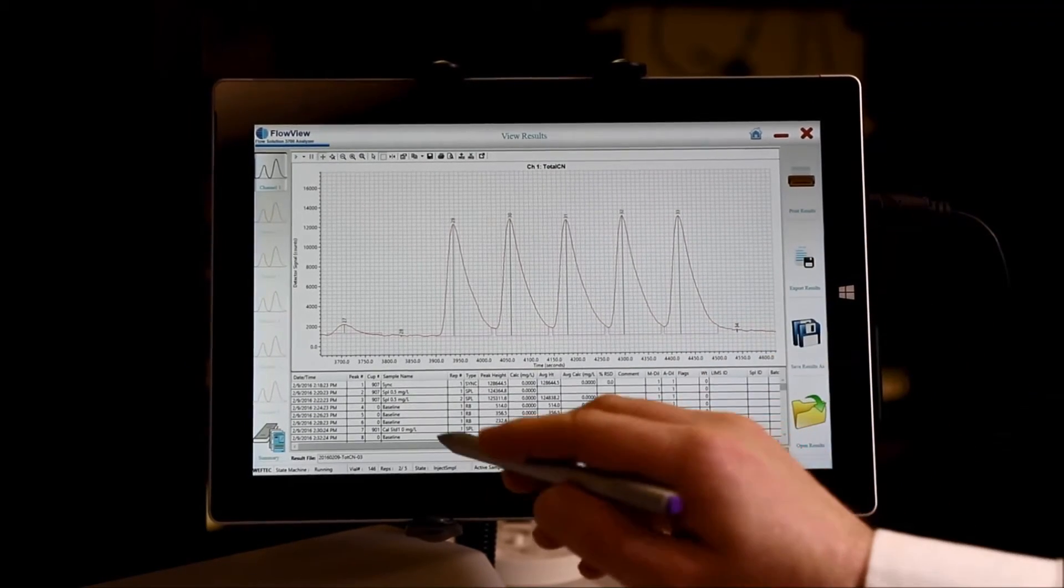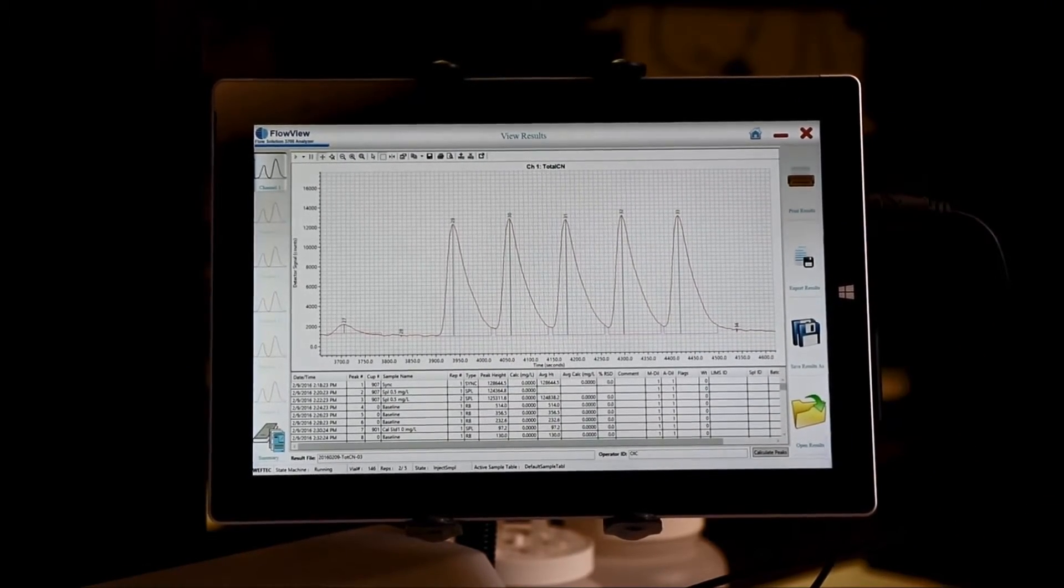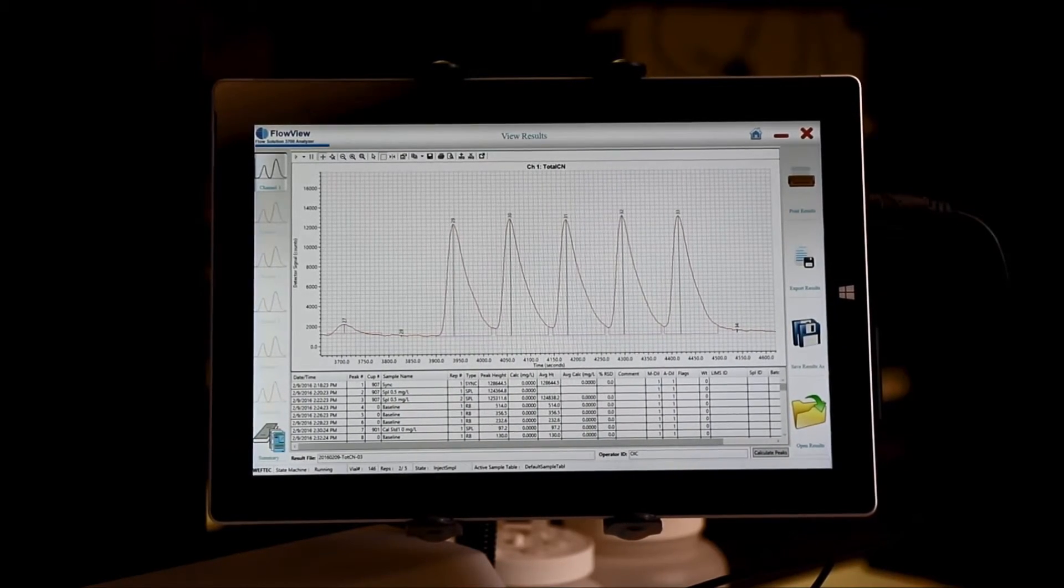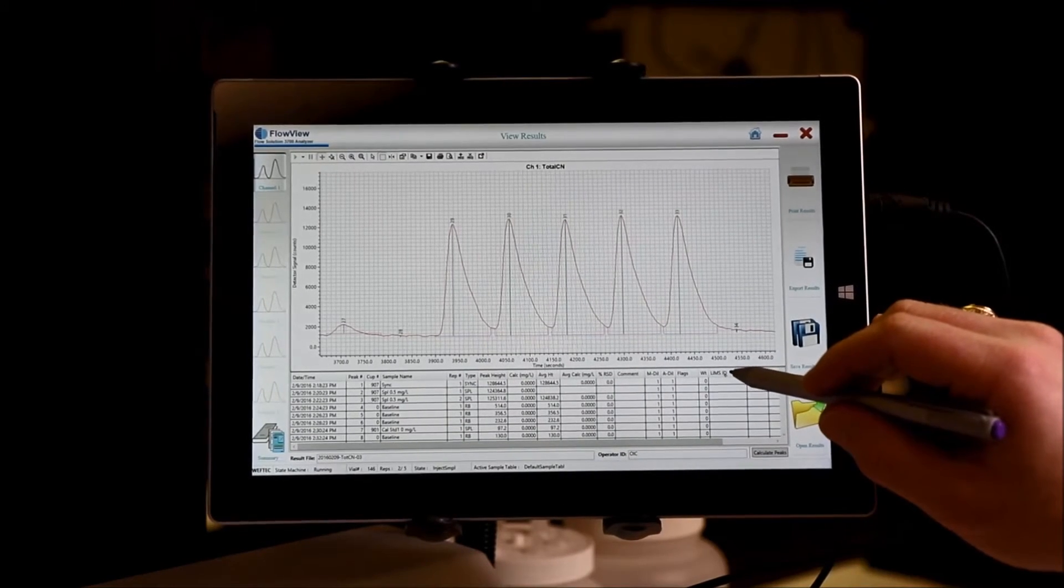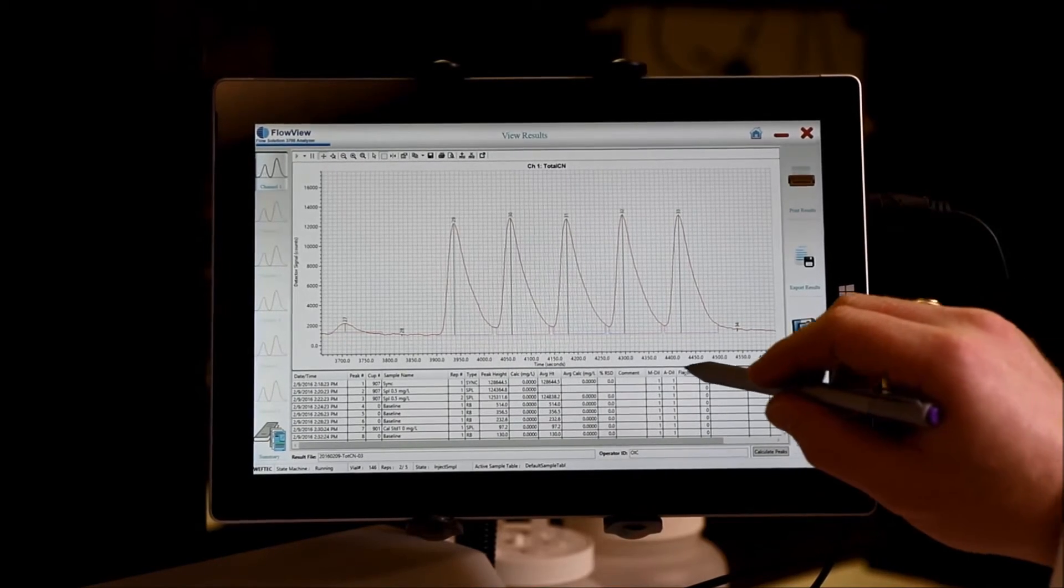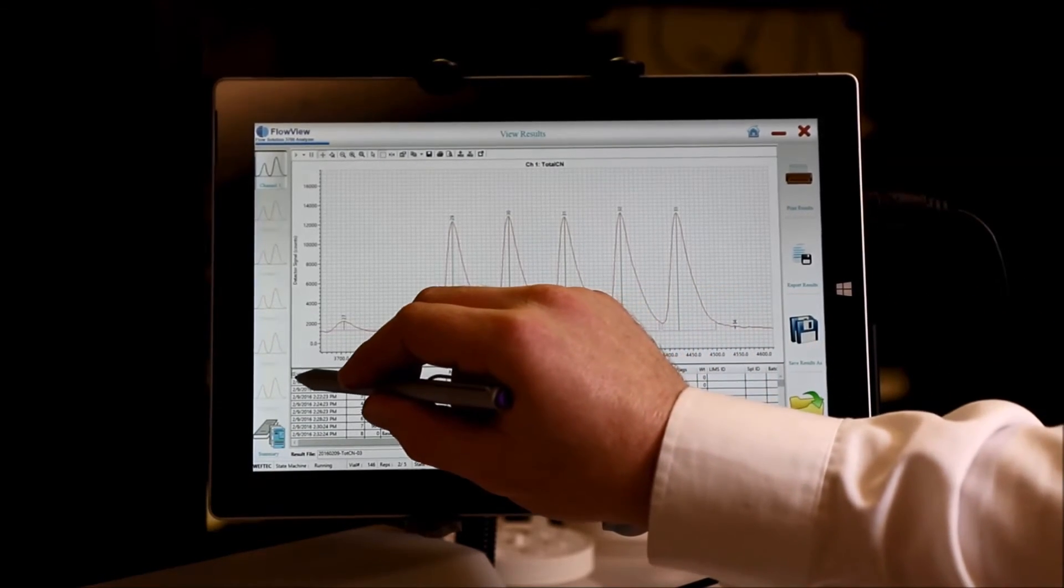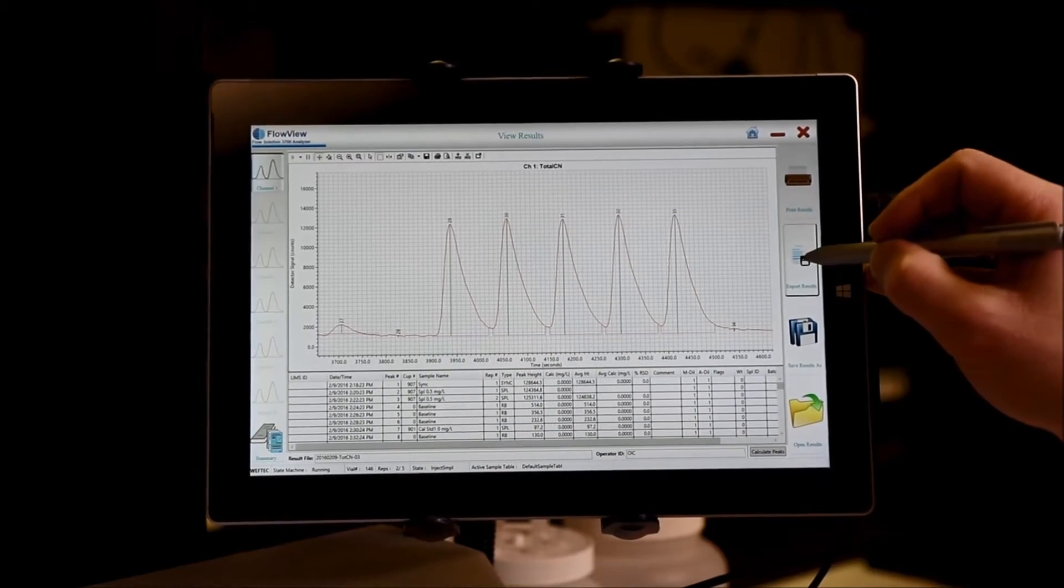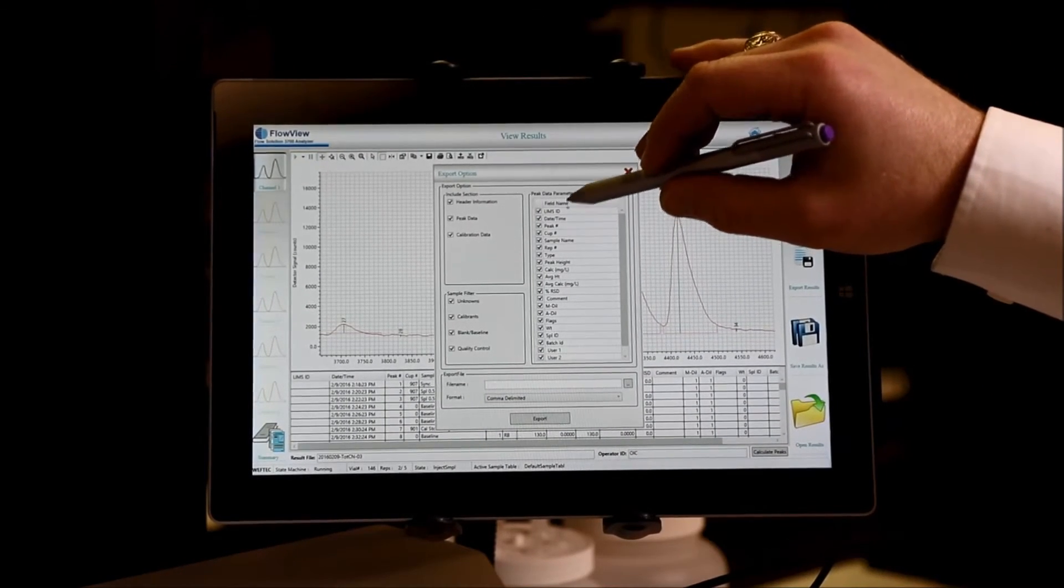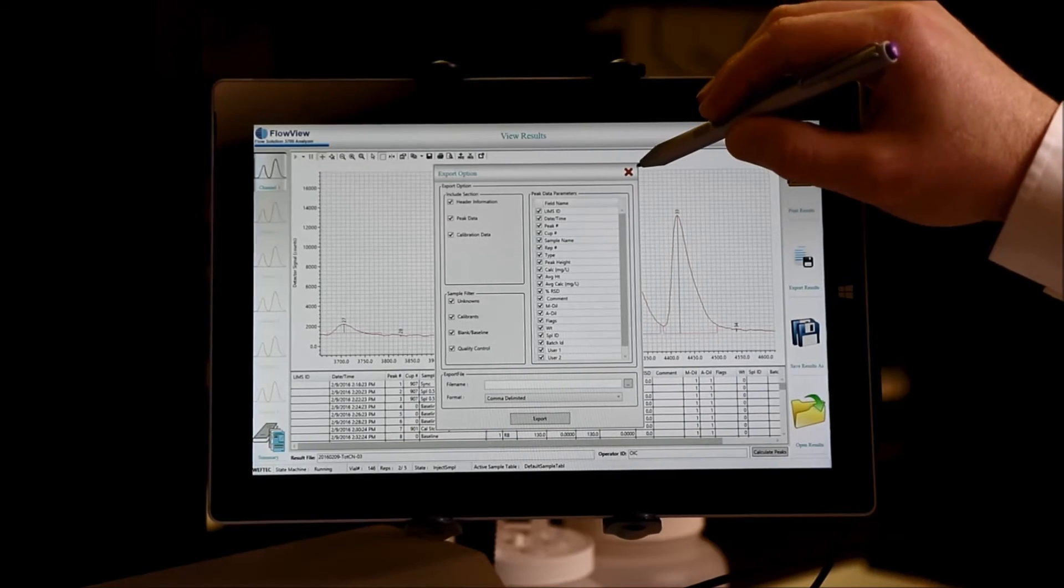In fact, if you have a problem configuring your LIMS or getting reporting the way that you want, perhaps you need the LIMS ID currently here on the screen to be the first field. Simply click and drag it to the first field. Then click on Export Results, and you'll notice that LIMS ID is now the first field that will export.